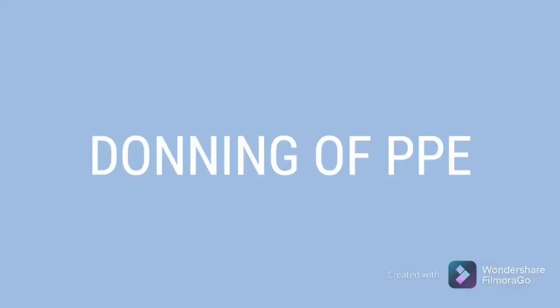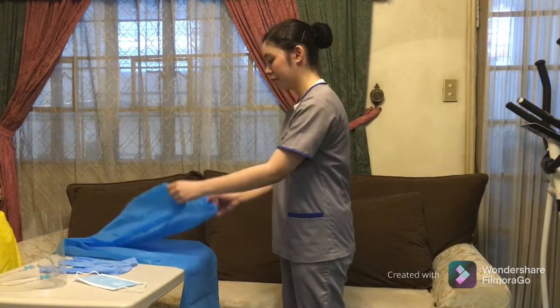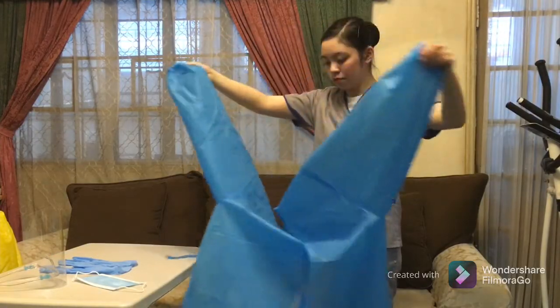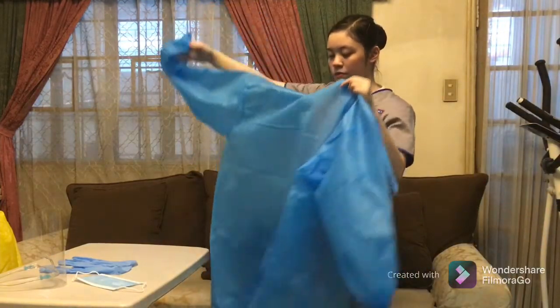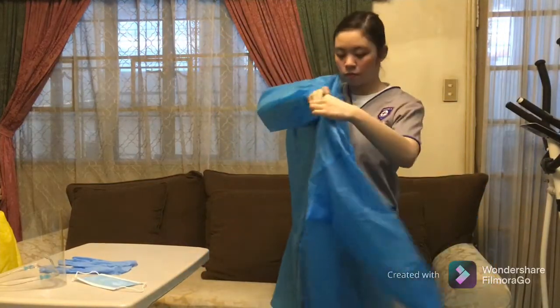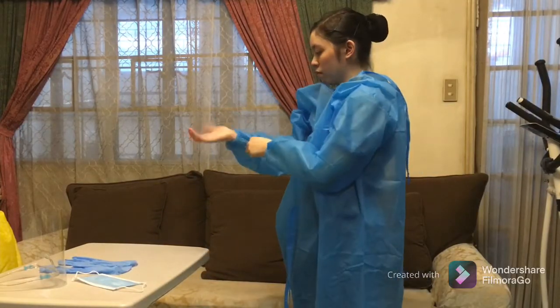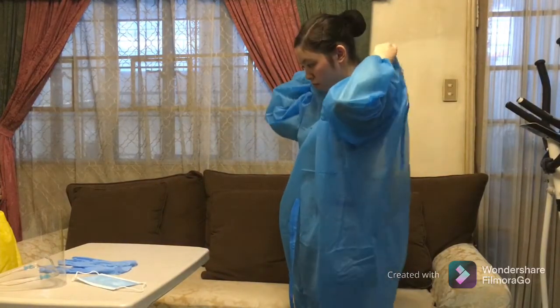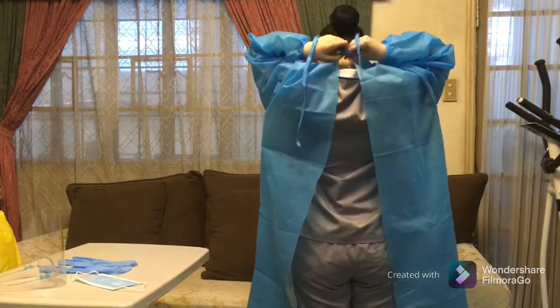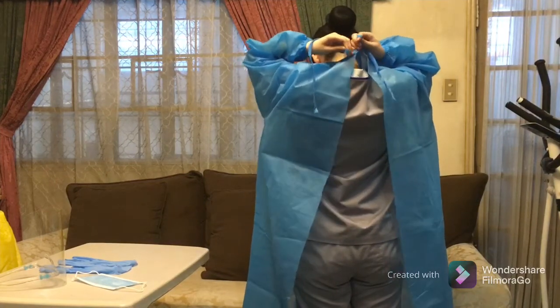Donning of PPE. Using the dominant hand, pick up the clean gown by locating and holding on to the edges of the arm holes. Allow it to unfold without touching any soiled surfaces. Once unfolded, hold the arm holes with corresponding hand and work both arms through the sleeves at the same time. Fasten the ties at the neck to keep the gown in place.